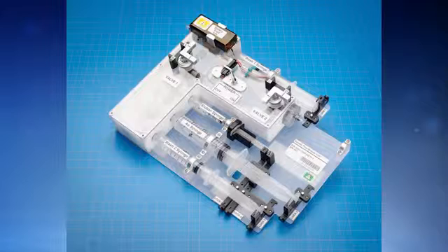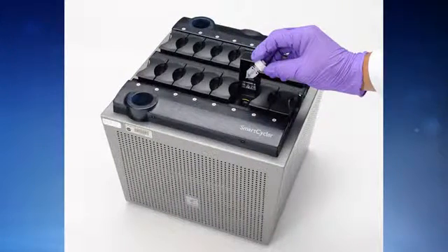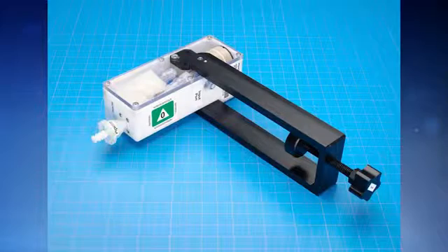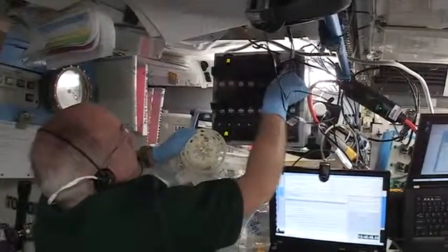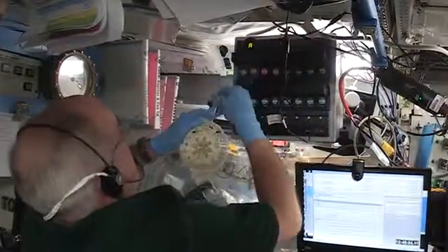The idea of the WetLab 2 system is to allow a crew member to sample from whatever the researcher is studying. Let's just say it's a bacteria, and then to be able to take that sample and put it into our system, and our system actually extracts the ribonucleic acid that I spoke about earlier, and allows the crew member to add that purified ribonucleic acid to tubes, which then do the analysis, the qPCR analysis that I explained earlier, so that the results are essentially just an Excel file that can be given to the researcher when the analysis is complete. So, we're essentially transferring a lot of this analysis work from the ground and doing it right there on board the International Space Station. That's pretty cool. Yeah, that's the idea.